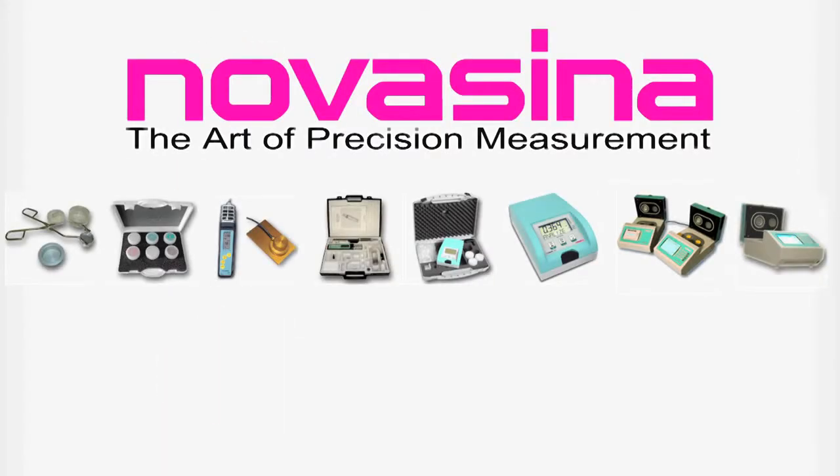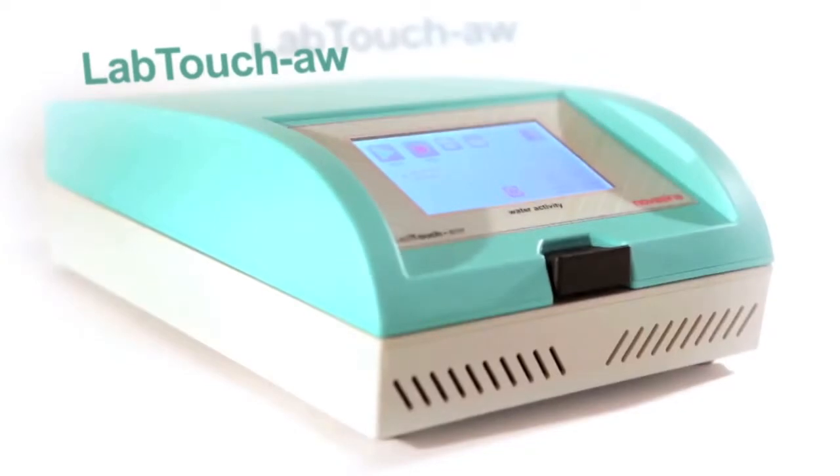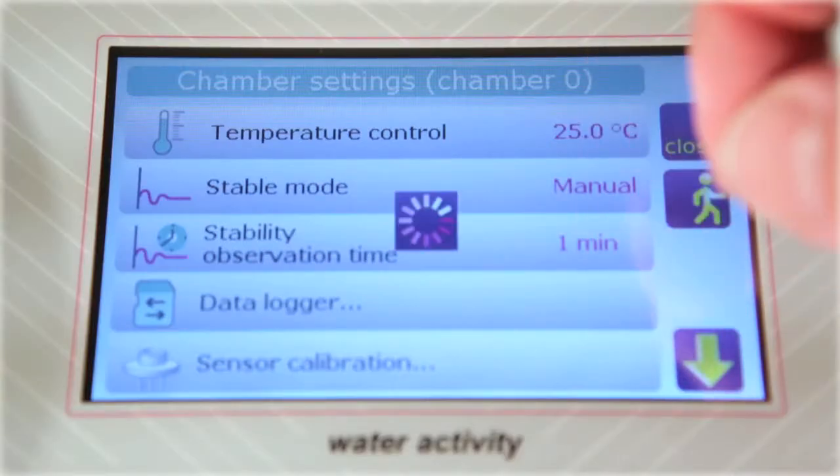NovaSena provides a wide range of water activity meters and proudly presents its latest instrument, the LabTouch. It comes with a full-color touch screen, temperature-controlled measurement chamber, and intelligent resistive measurement cell.